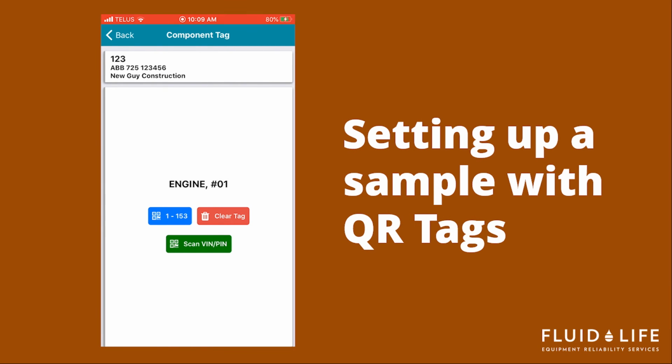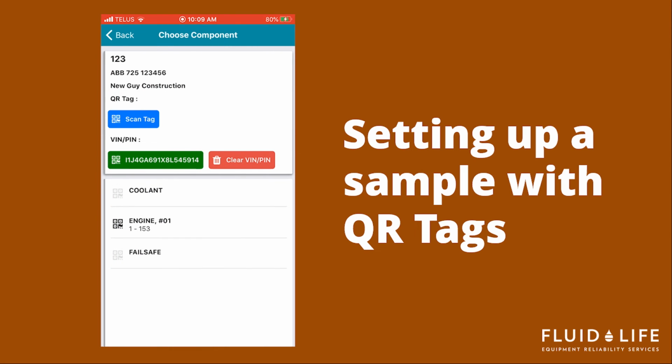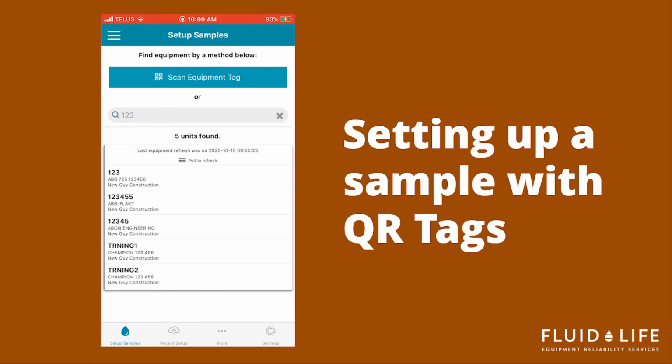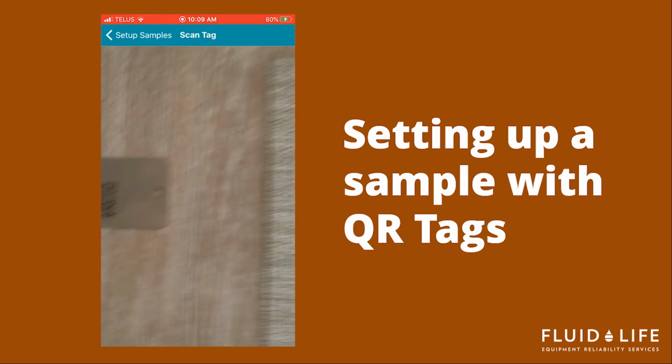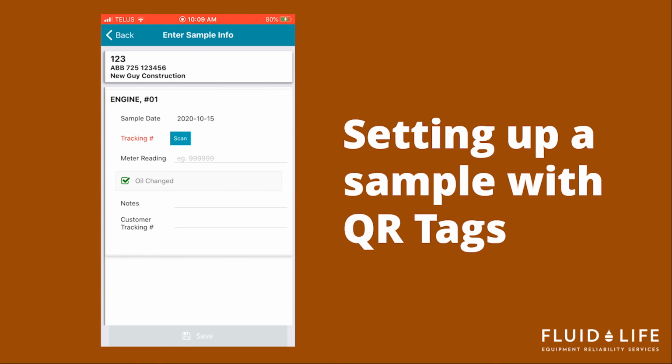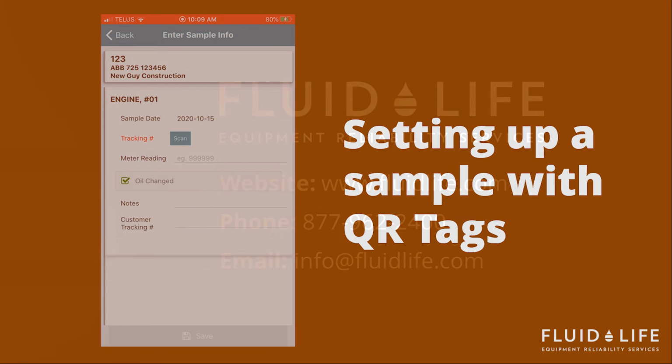So next time you're looking to set up a sample using the MyLab app, you simply click on Set Up Samples, click on Scan Equipment Tag, scan the tag, enter the information, scan the sample bottle, and you're ready to go.